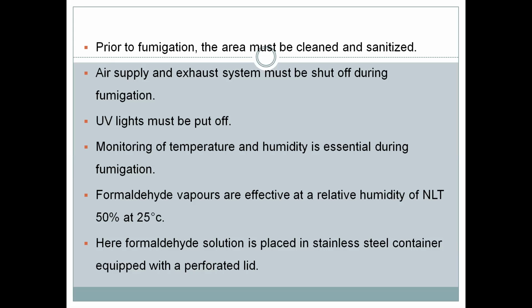Monitoring of temperature and humidity is essential during the fumigation. That's the most important aspect. Formaldehyde vapors are effective at a relative humidity of not less than 50% at 25 degrees centigrade.